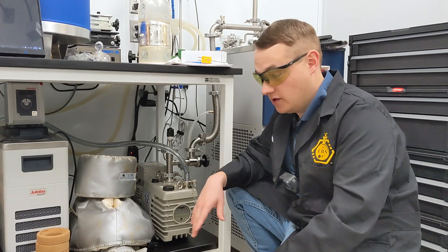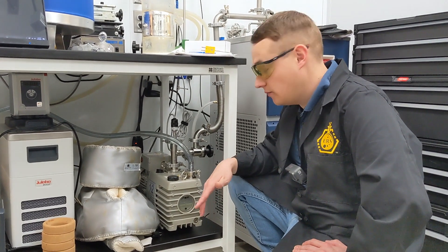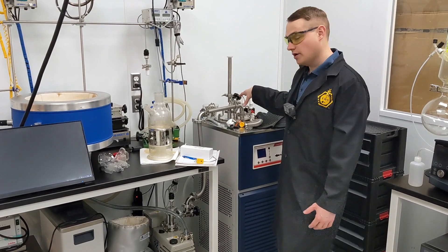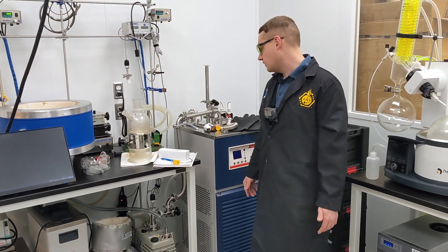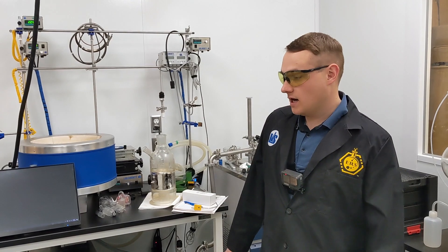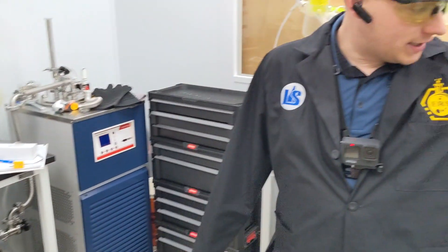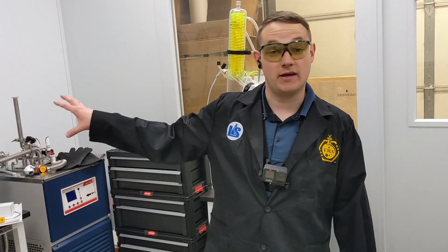These pumps are fantastic — we have a whole bunch of different ones that we've personally put our ETL and CSA listing on. This right here is the cold trap protecting that pump. With this type of pump, we want to use a cold trap to keep all the material that would otherwise go into the vacuum pump contained in the trap. Cross International was generous enough to let us use one of these — it's a T80X — and so far so good. Wet and dry vacuum pumps are both extremely crucial in a laboratory. As you can see, I've got four different kinds right in front of you, all geared toward a different purpose: low vacuum, medium vacuum, high vacuum, and high vacuum. These two pumps are technically both high vacuum pumps. Sure, I could use that Pfeiffer pump on my benchtop SPD, but that pump is expensive and I do not want to ruin it with what comes out of a benchtop SPD.